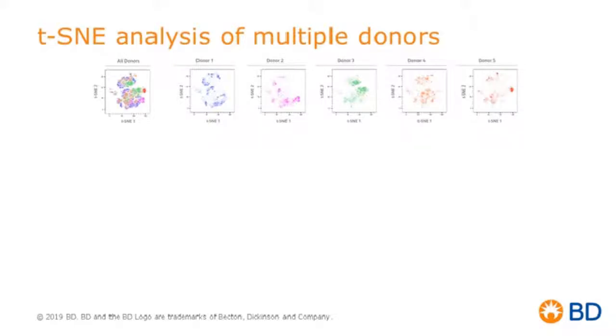And we are using t-SNE analysis as a dimensionality reduction tool that basically takes all the information and all the expression of the markers and reduces the visualization and the allocation of these markers into a bidimensional space. And it creates what we now refer to as clusters or islands.